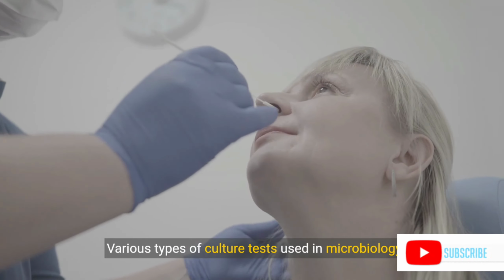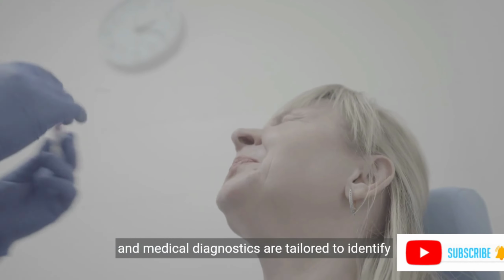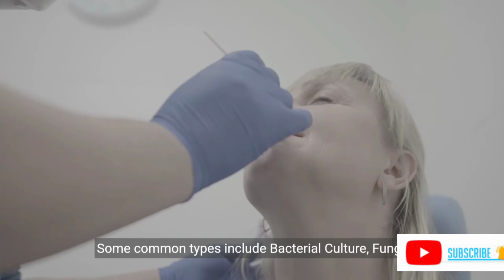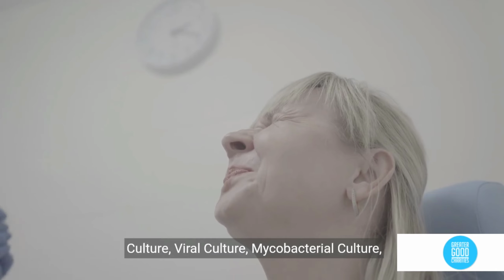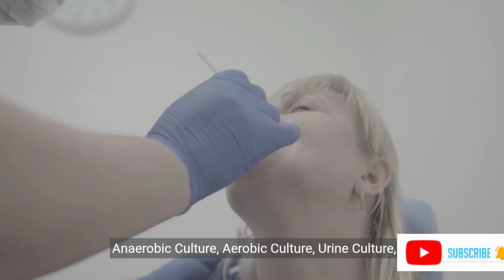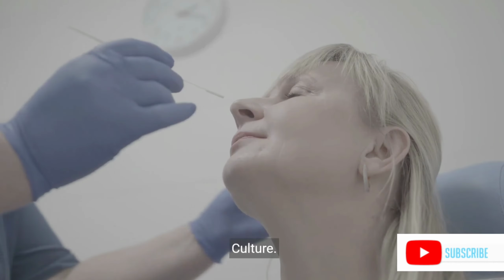Various types of culture tests used in microbiology and medical diagnostics are tailored to identify specific types of microorganisms. Some common types include bacterial culture, fungal culture, viral culture, mycobacterial culture, anaerobic culture, aerobic culture, urine culture, stool culture, tissue culture, and environmental culture.